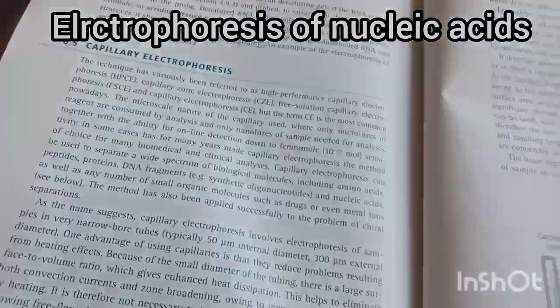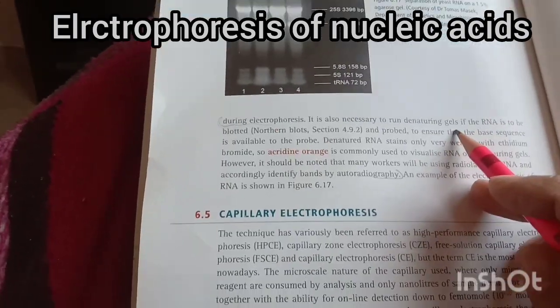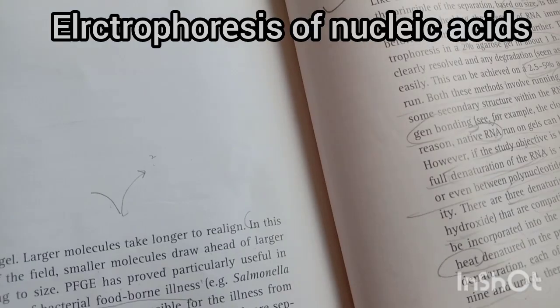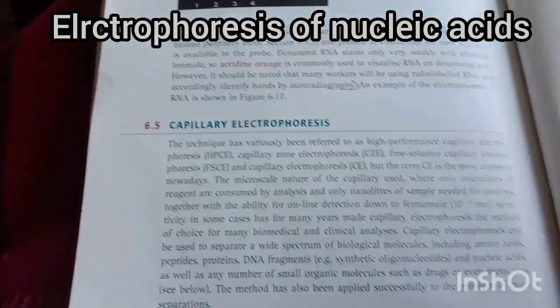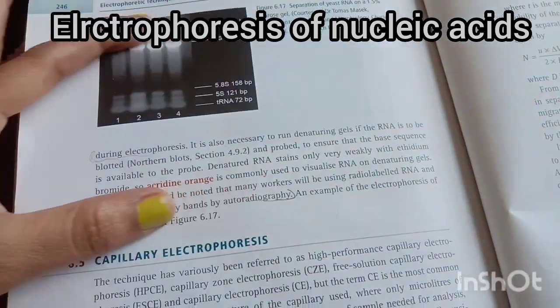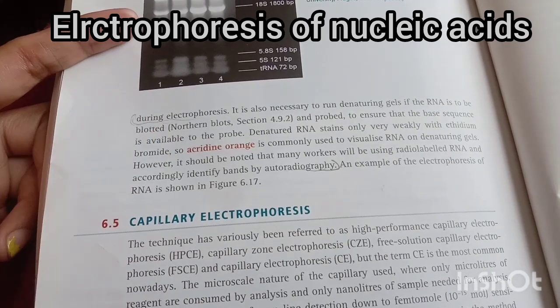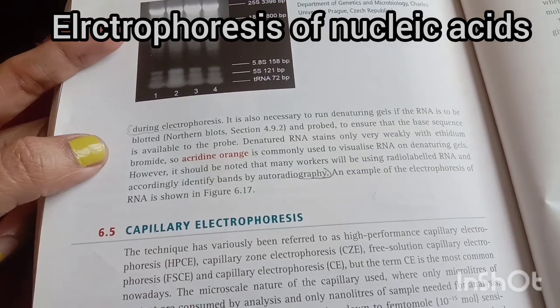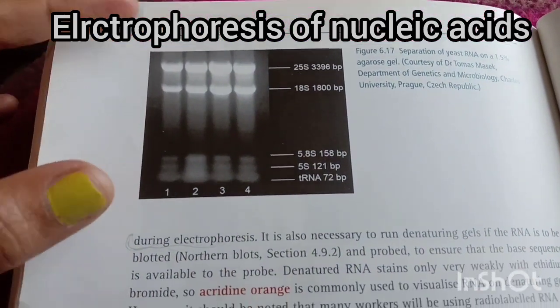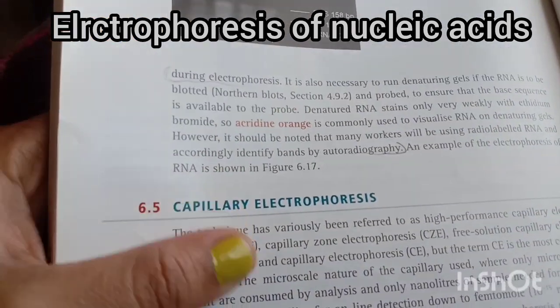So during the electrophoresis, it is also necessary to run denaturing gels, like we studied about formaldehyde, glyoxal and methyl mercury hydroxide. This is very essential in RNA gel electrophoresis. We can also use northern blot techniques and a probe to ensure that the base sequence is available to the probe. You can see the structure. This is a separation of yeast RNA using a 1.5% agarose gel for the RNA analysis.